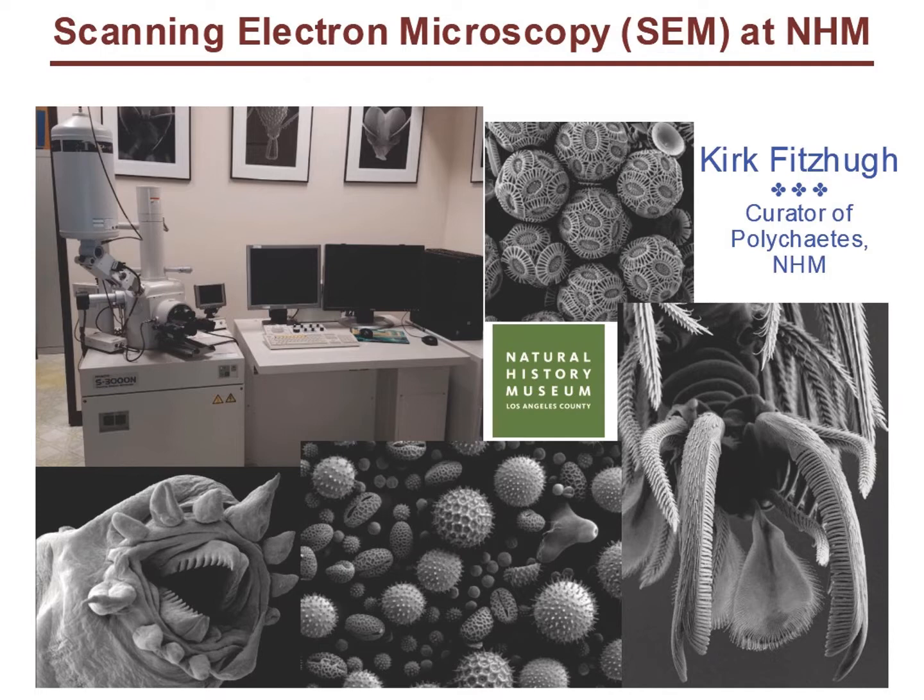Today, I'd like to tell you more about our SEM, what it looks like, some basics on how it operates, and how it's unlike the microscopes you're probably familiar with. In many ways, knowing how scanning electron microscopes operate is just as remarkable as the images they produce. So I hope you'll enjoy this presentation.